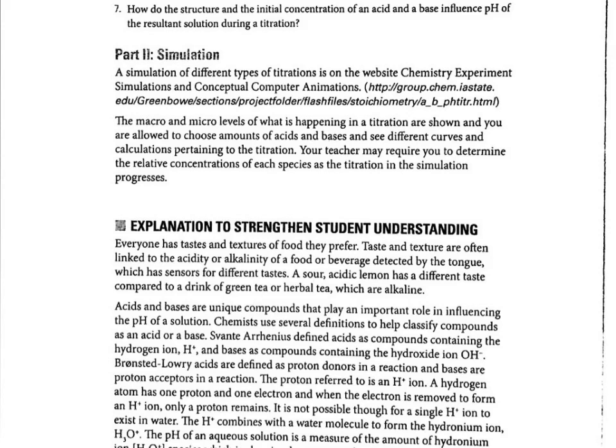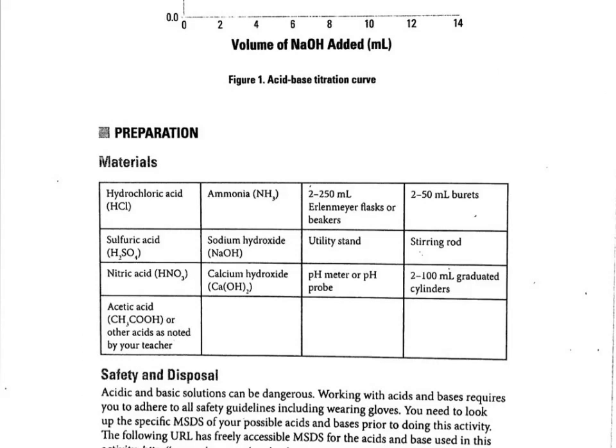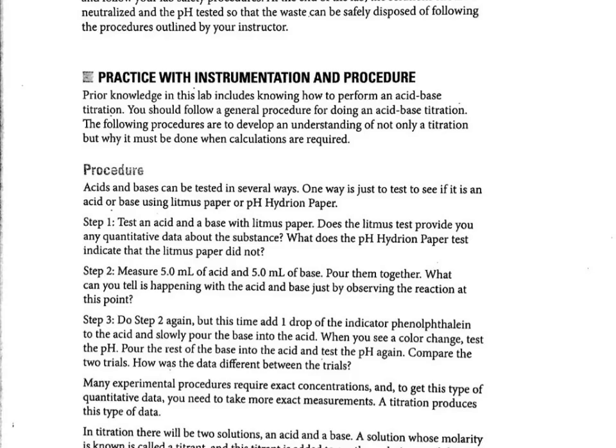If you go to that website, it will actually allow you to do a strong acid, strong base titration, and you could just do a practice one there and use the data that you get there to make a graph. So if you want to do that, that's fine. I found that website to be less helpful than I was hoping it would have been, but it could bail you out maybe if you had some trouble with that practice procedure. Okay, so I want that on there.